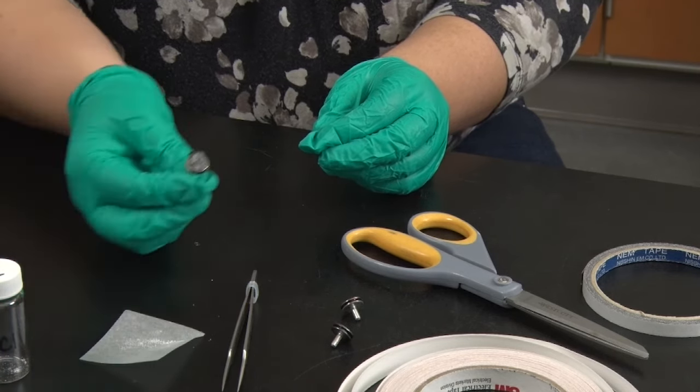Once these things are done, it is pretty easy to move around on the sample and zoom in or zoom out. The scale bar at the bottom right of the image lets me know how big the features in my sample are. These particles are on the order of hundreds of microns.